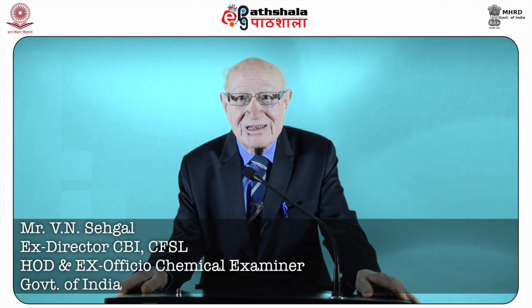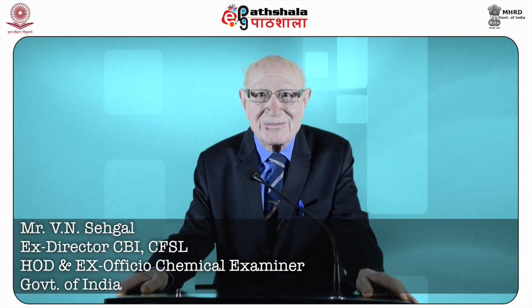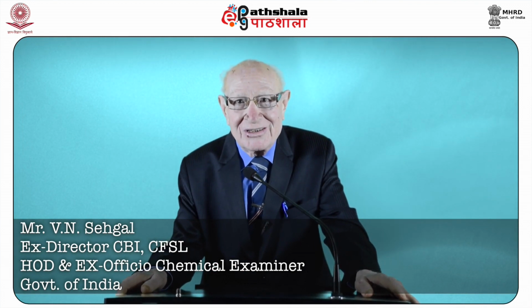Today we shall discuss GSR analysis by instrumental methods. There are two types of methods which are used for the estimation of GSR particles. The examination is carried out either by chemical analysis or by instrumental analysis. Of the two methods, instrumental methods are far superior because of the simple reason that they are more sensitive, more accurate, and they are less time consuming.